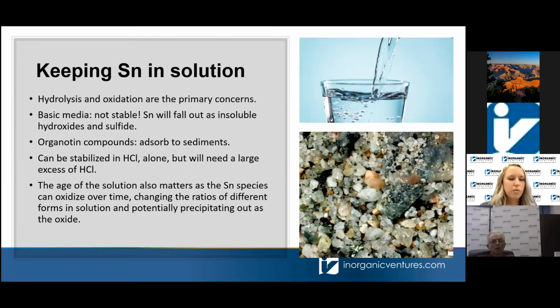One thing that I do want to point out is that if you're working with tin in environmental water samples, most of that tin is going to be found in the sediments because organic tin compounds adsorb to the sediments at the bottom of streams or lakes or environmental systems. So most of your tin is going to be found in the actual sediments at the bottom of the water.